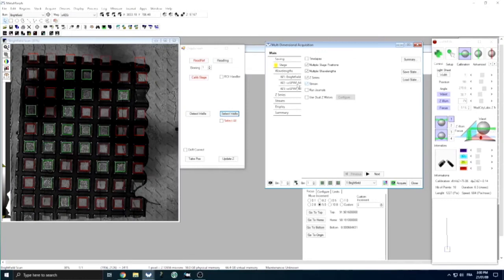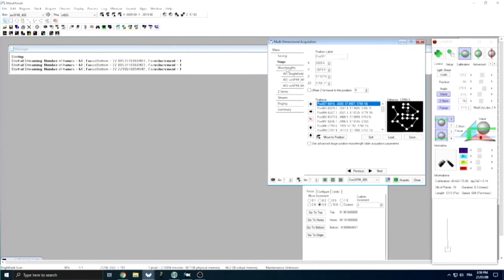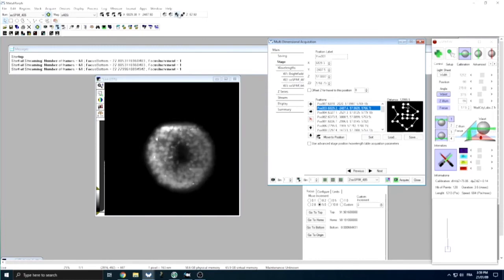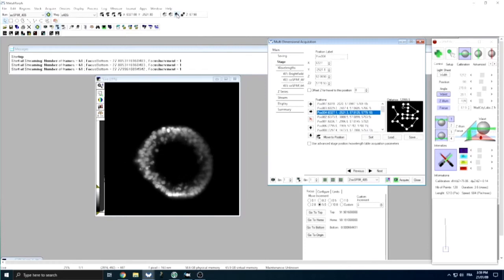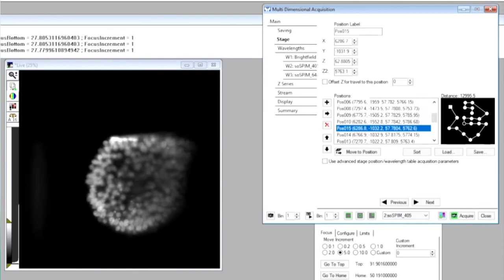The positions of all the selected G-wells are then directly sent to the MDA tool that handles the multi-position acquisition process. We can see that all positions have been saved into the stage panel of the MDA tool. Here we selected 20 positions, which we can sort in order to minimize the overall distance the objective has to travel. We can navigate through all these positions and check whether the excitation and image planes are correctly superposed to allow for optimal 3D imaging on all positions. The positions that have been selected have been automatically corrected according to a G-well reference position in which the light sheet has been adjusted to ensure this superposition.